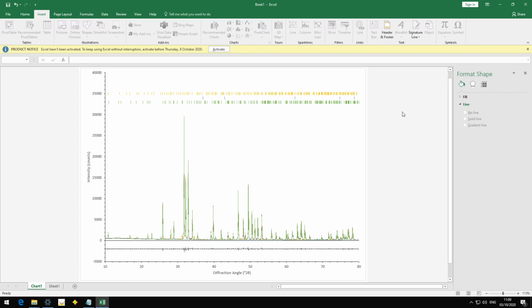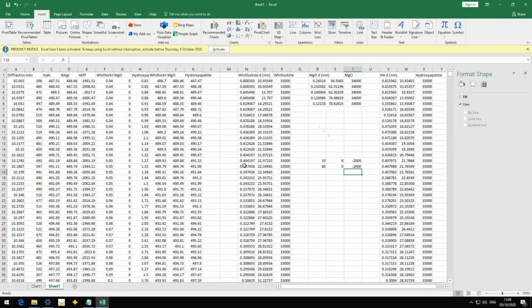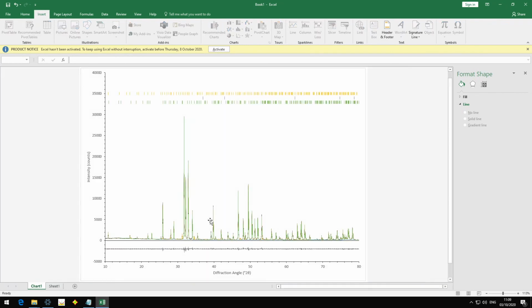So I think some of you might prefer to have it in Excel because we can still shift it around easily. Most of us are more familiar with Excel than with drawing programs. But as you can see, it is quite a bit of work. Considering that it will probably be used for a publication, it's probably worth the investment. If you use another spreadsheet program, for example LibreOffice, it will be pretty much the same.